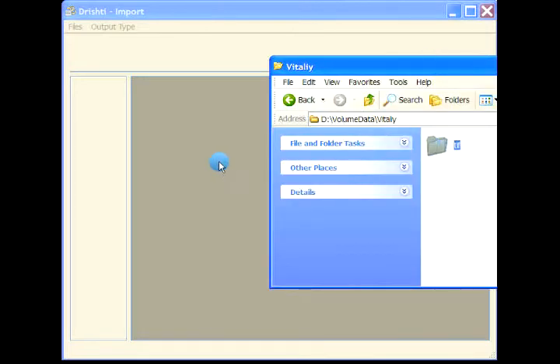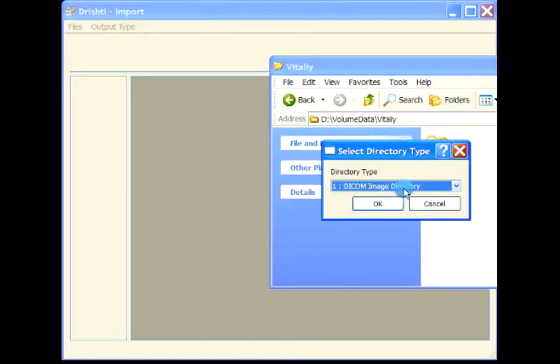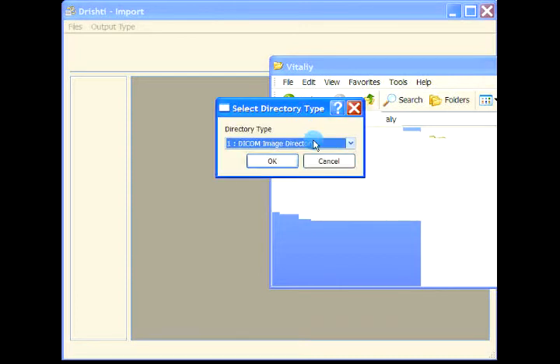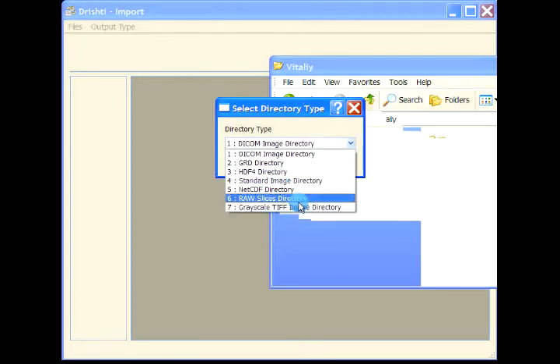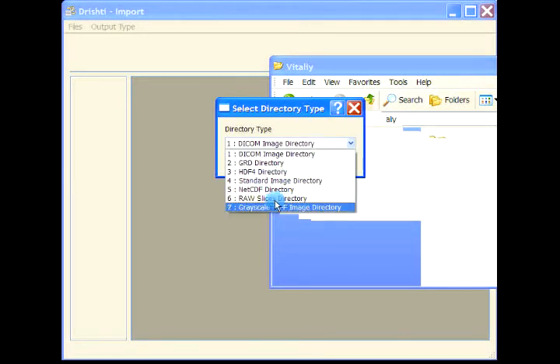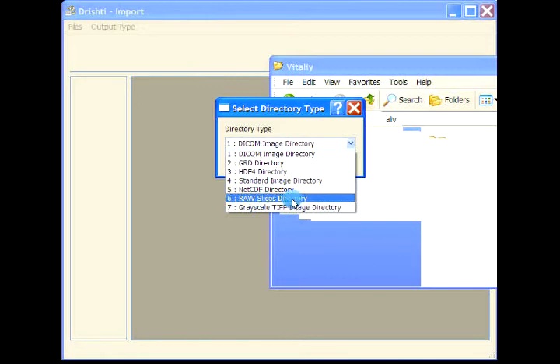Now, instead of selecting grayscale TIFF directory, I'm going to select raw slices directory. I've looked at the dimensions of the image - they are 800 by 800.